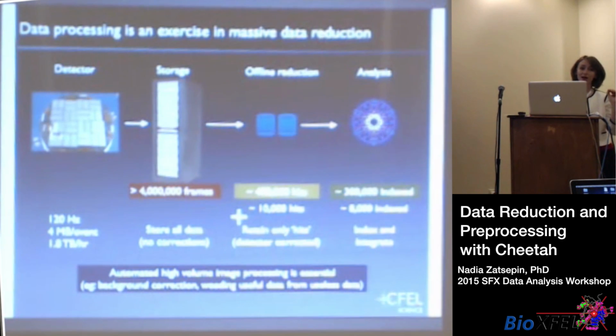If you are getting a crystal diffraction pattern on every shot, that means your concentration is incredibly high and at least 2/3 of your patterns are more than a single crystal hit. So theoretically, with a homogeneous distribution of same size crystals, your best aim is a 30% single crystal hit. I won't dwell on that. The point is, after data reduction, a good number is to assume 10%.